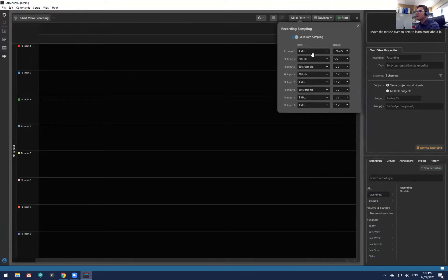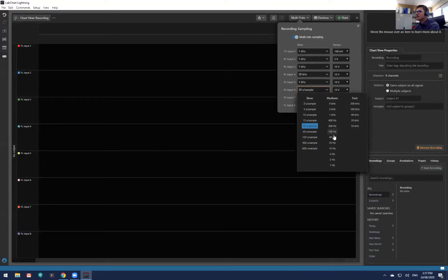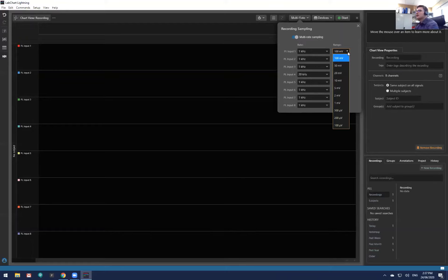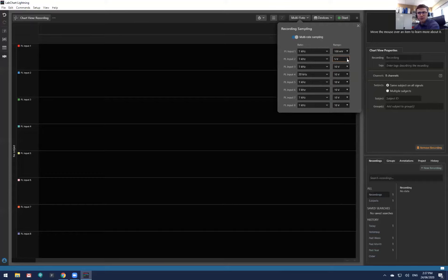I'm going to keep all channels at one kilohertz. You'll notice the ranges are different for the first two inputs — the range means the plus-or-minus value your data will be recorded within. Input 1 is connected to the BioAmp for biopotentials such as ECG. Input 2 is five volts for my Bridge Amp, which I'll use to calibrate the blood pressure transducer. Any input with nothing connected defaults to a 10-volt range.